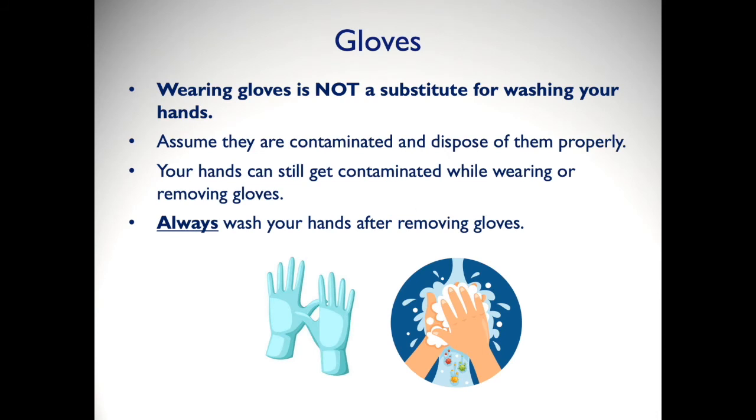Remember, wearing gloves is not a substitute for washing your hands. Assume they are contaminated and dispose of them properly. Your hands can still get contaminated while wearing or removing gloves. Always wash your hands after removing gloves.